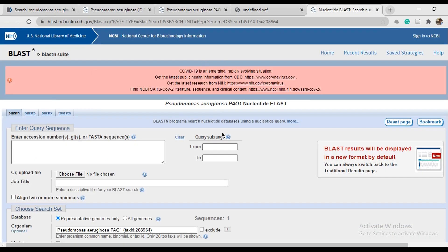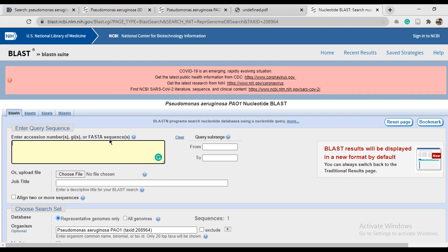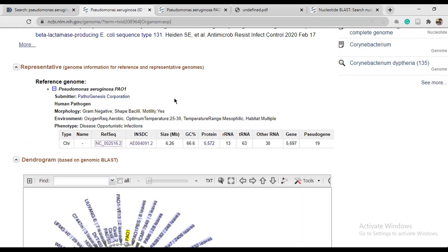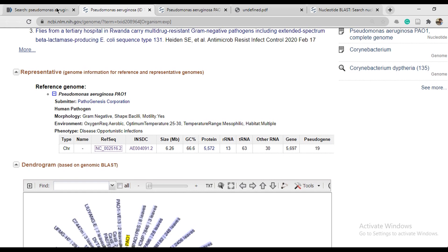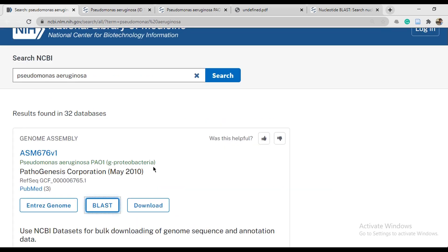BLAST sequence we use only for alignment. Like we have two bacteria sequences, we align here. Next section for FASTA sequence.